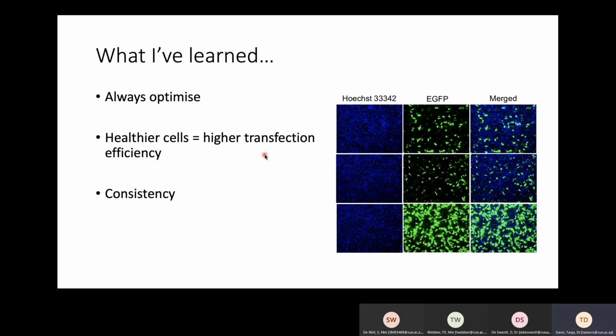The other thing is, as simple as it sounds, healthier cells will always give you better transfection.